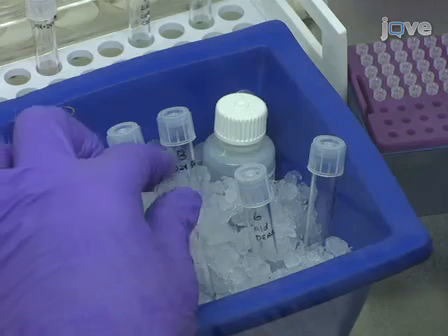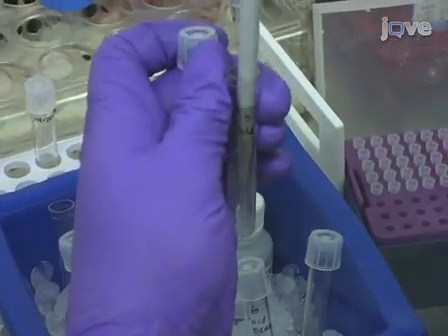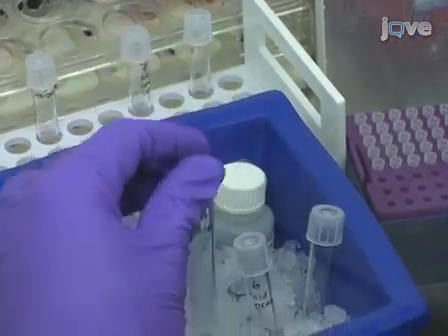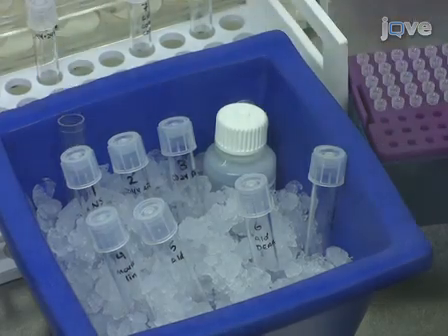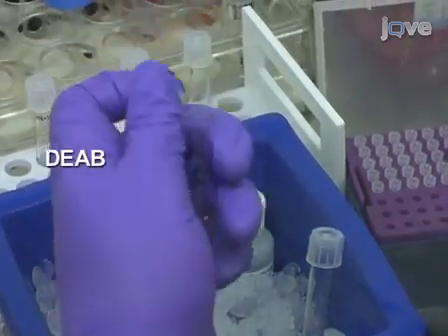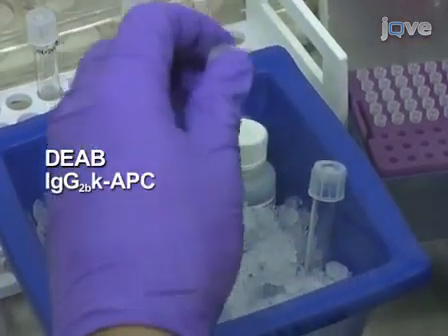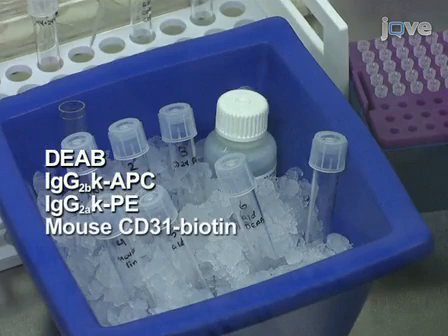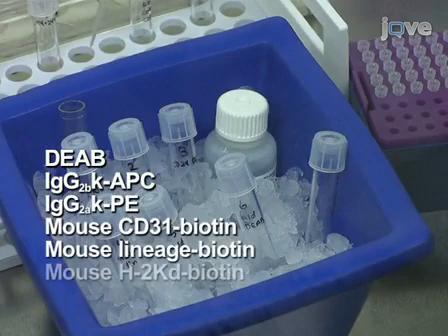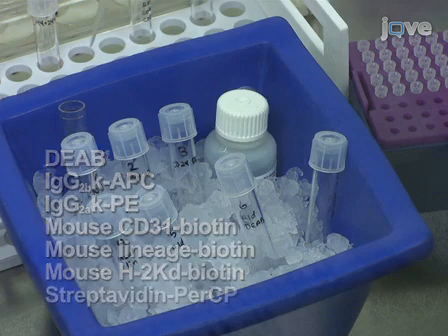Also prepare a fifth sample containing Aldefluor only and a sixth sample for setting the ALDH positive and CD44 positive CD24 positive gates. This sample will contain Aldefluor, DEAB, an inhibitor of aldehyde dehydrogenase, isotype control antibodies IgG2b kappa APC, IgG2a kappa PE, mouse CD31 biotin, mouse lineage biotin, mouse H2Kd biotin, and streptavidin PerCP.